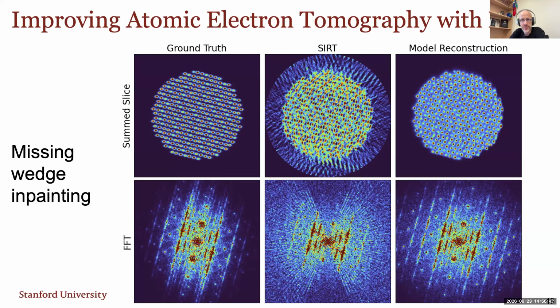So we are working on just such an algorithm where we combine INRs with the micro ED or 3D ED reconstructions here. And this last question, does that mean convolutional networks work well for electron diffractions? I would say yes, but when you have a lot of sharp features, really high spatial frequencies, that's where the K-plane tensor decomposition tends to outperform MLP or CNN INRs. So more on that later.